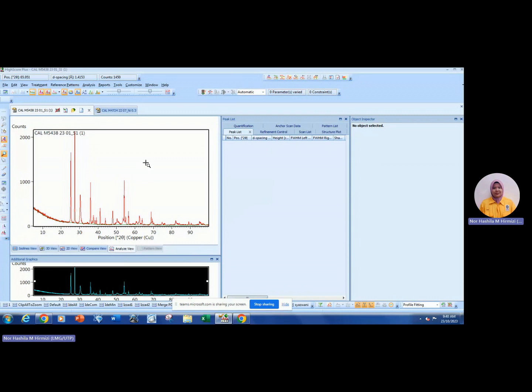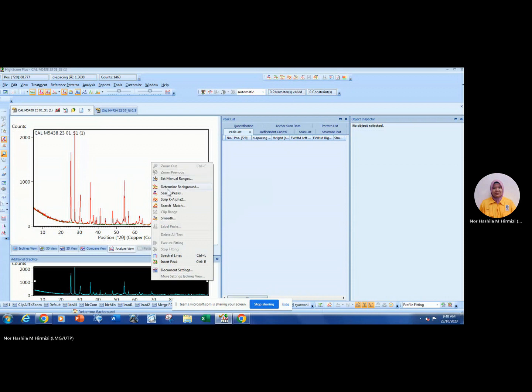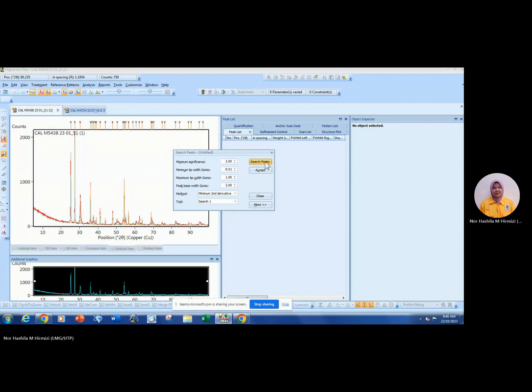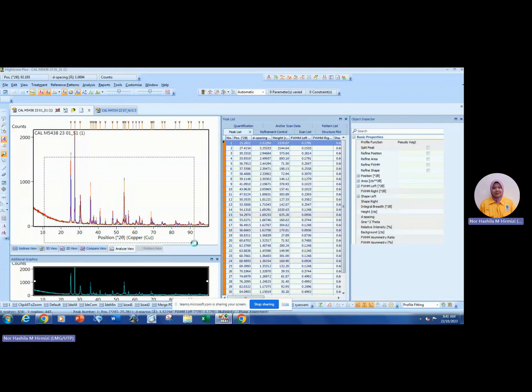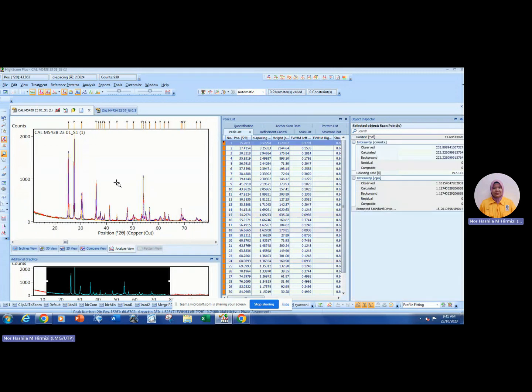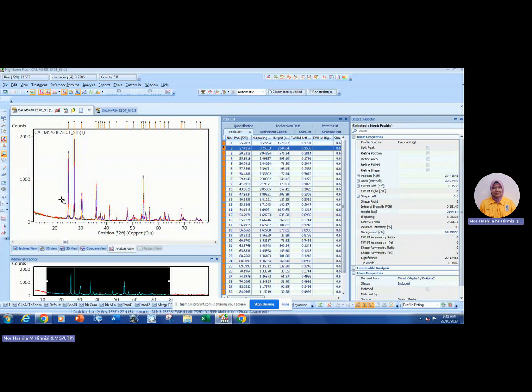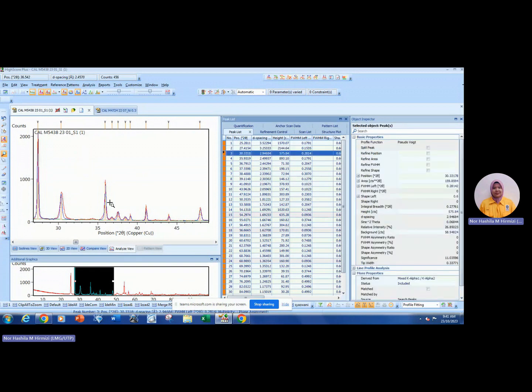The next step is to determine the peak. For the second step, right-click, click 'Search Peak,' and then Accept. The software will determine the graph for you. You can see a blue graph and a red graph — the red graph is the original data from the XRD analysis, while the blue graph is generated by the software based on the background and search peak.